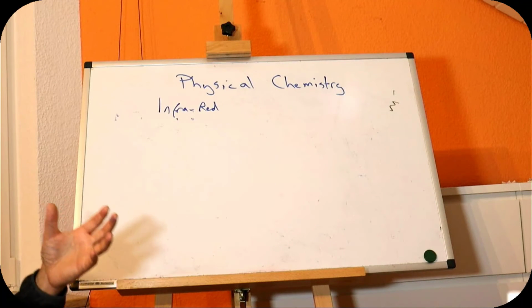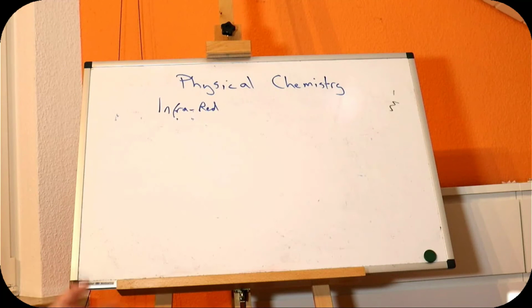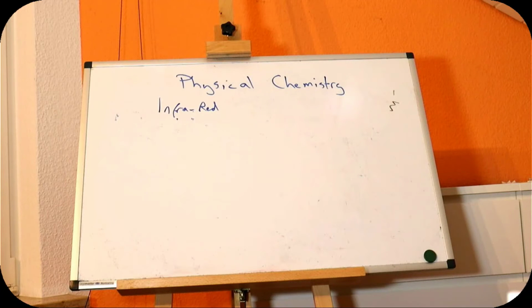Whereas a Raman spectrometer is comparatively easy to measure things that don't do you any good for a variety of reasons. My main focus with infrared, however, is more about the practical use of it, because we don't have an infrared course in organic chemistry. And therefore, we're going to look at the bonds that we would measure in infrared.